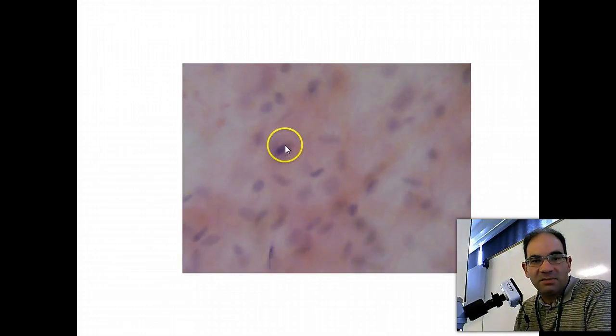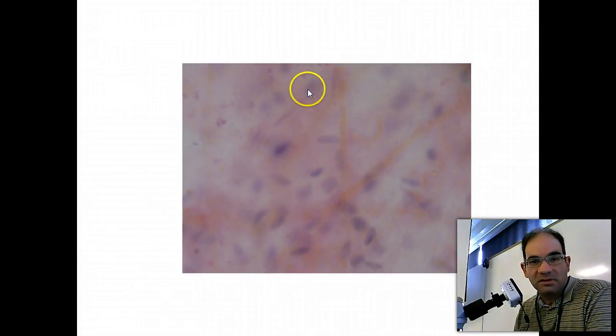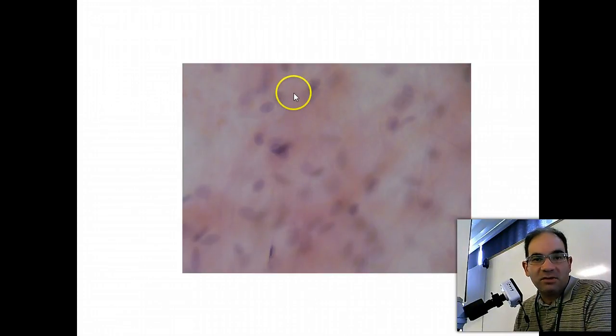And the dark staining spots here is what we're going to call the nuclei of the fibroblasts. So there's some nuclei of the fibroblasts right there. And then everything in between, or you could think of as the background, is going to be the matrix.